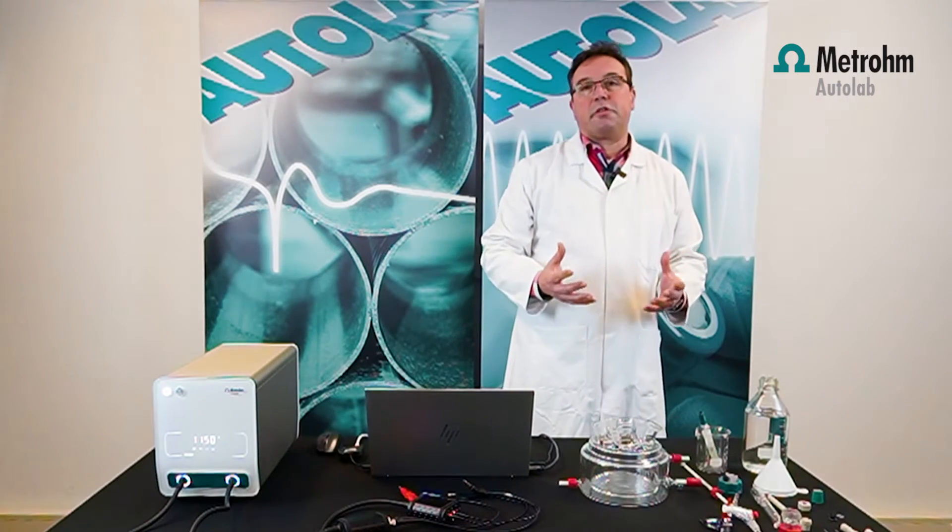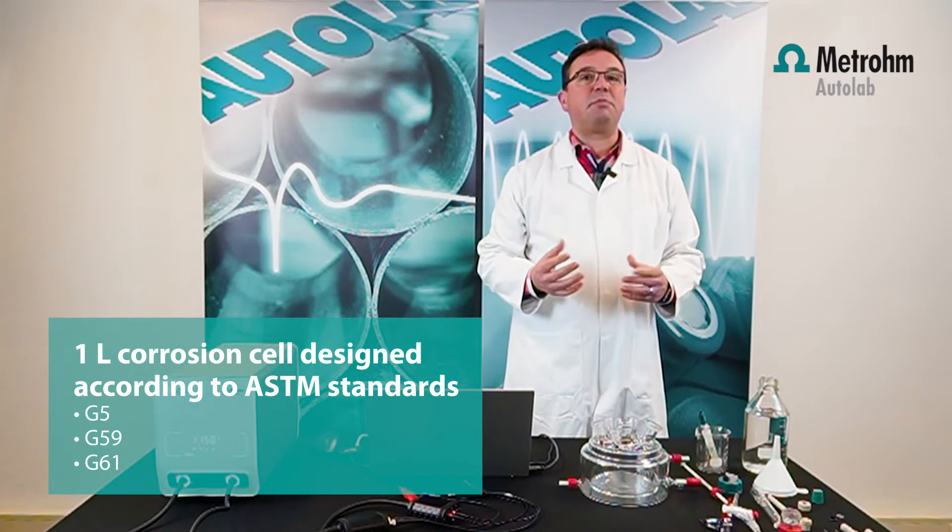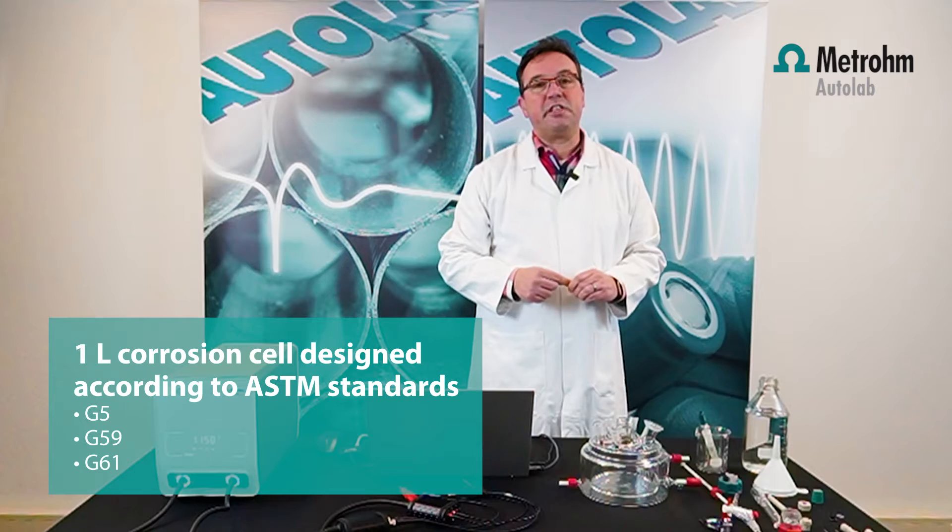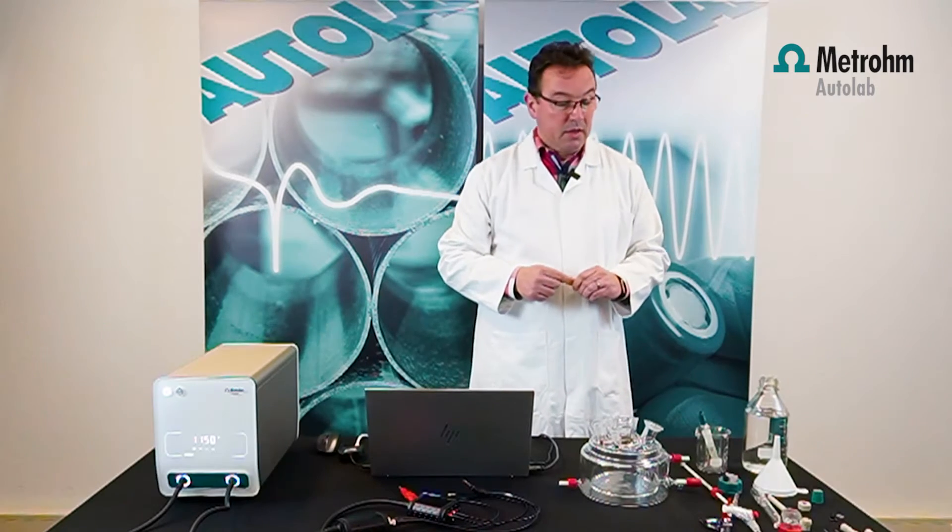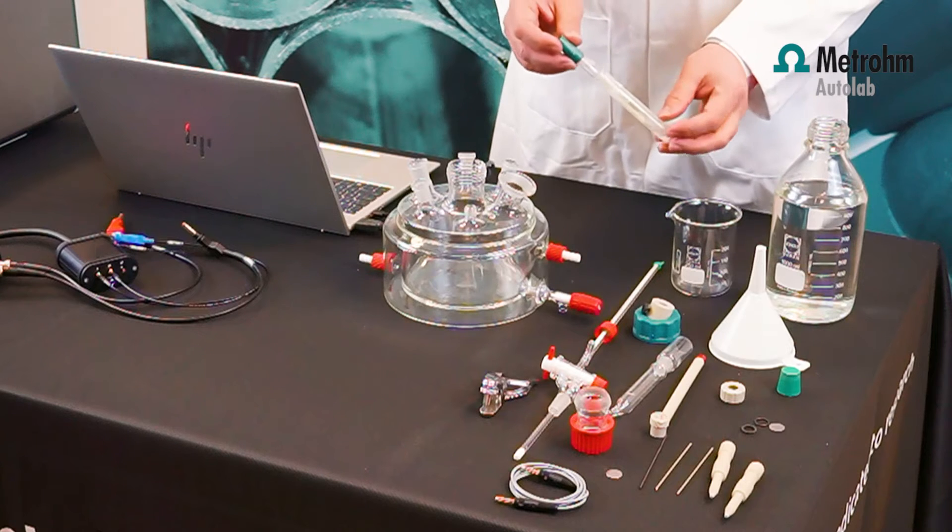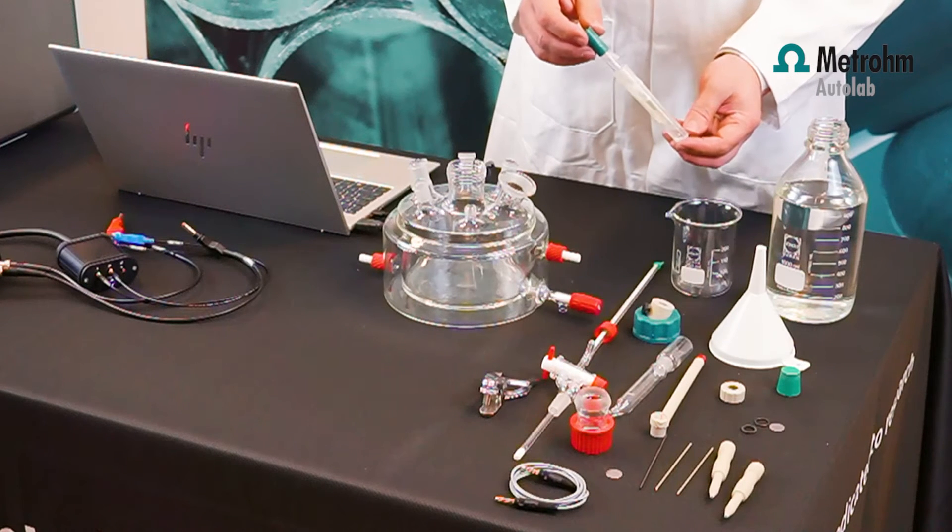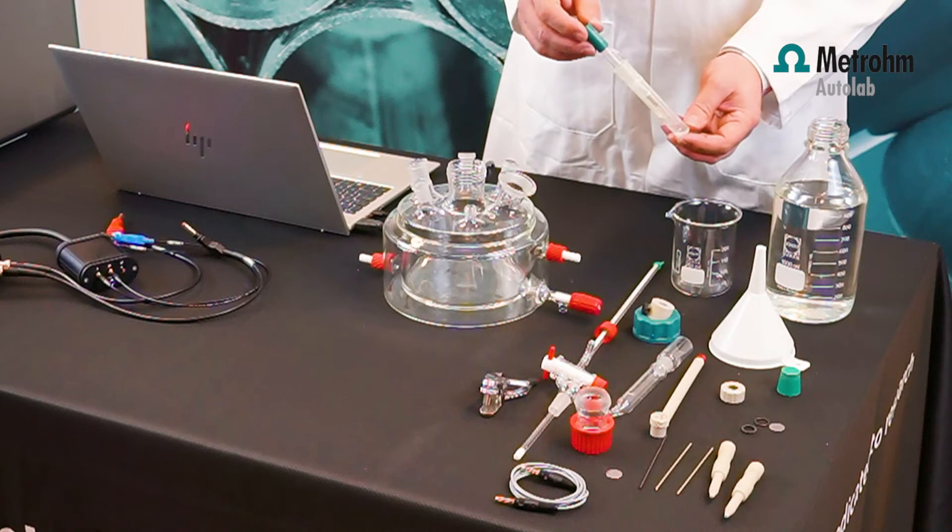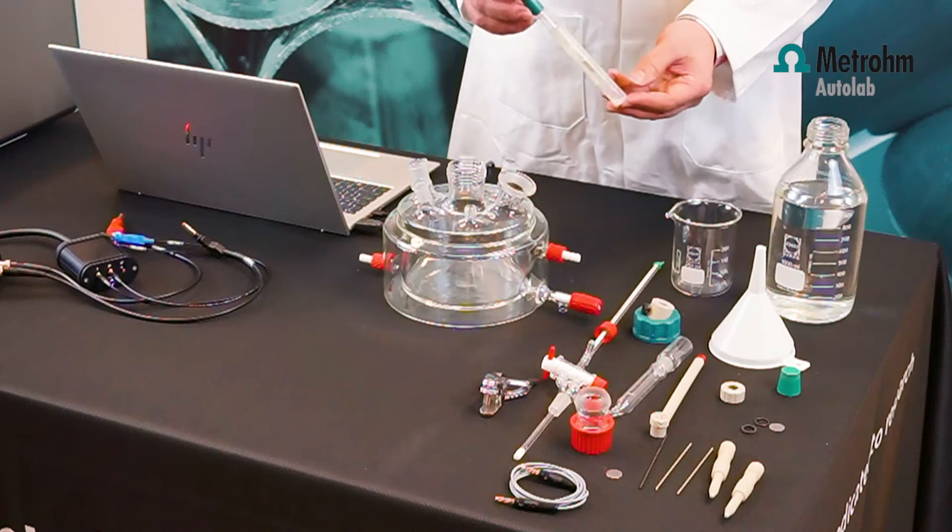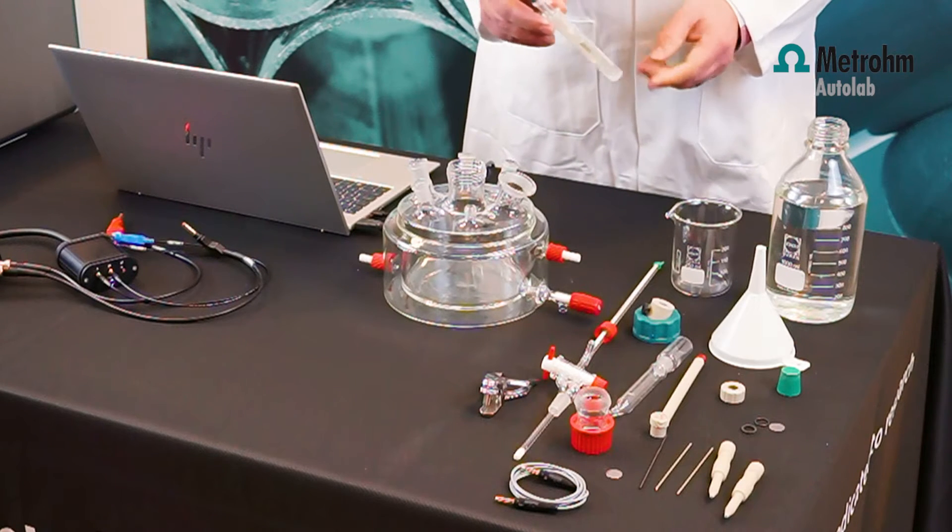Now we're going to construct the corrosion cell. It's a one liter ASTM standard corrosion cell for G5, G59 and G61 standards. The reference electrode is filled with 3 molar KCl solution. Make sure that the electrode contains enough electrolyte, 3 molar KCl, before the measurements start. This one is connected to the blue banana plug of the Vionic, and the electrode should be placed inside of the Luggin capillary.